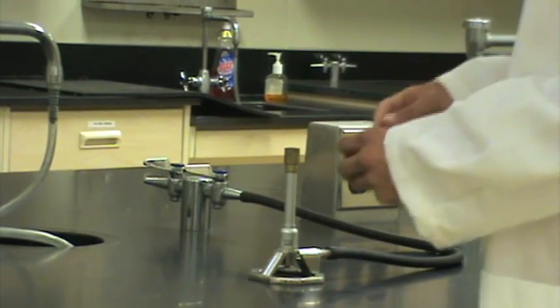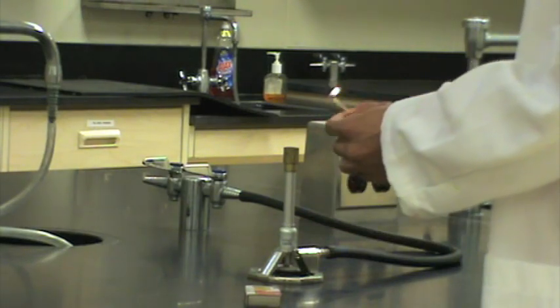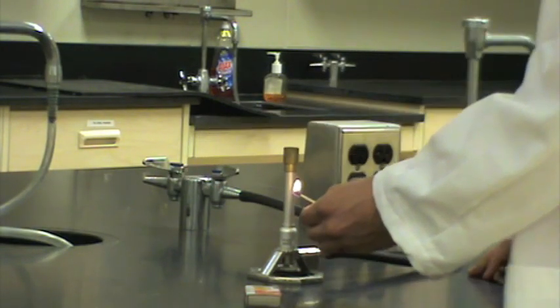If you are using matches, you should light the match before turning the gas on. Then, raise the match up to the gas and it should light instantly.